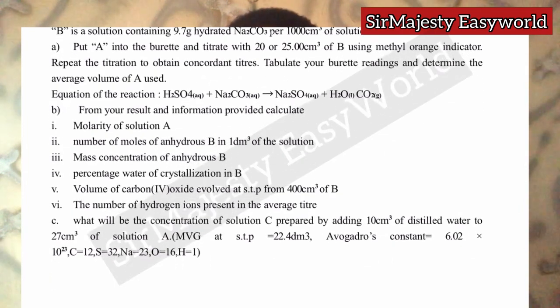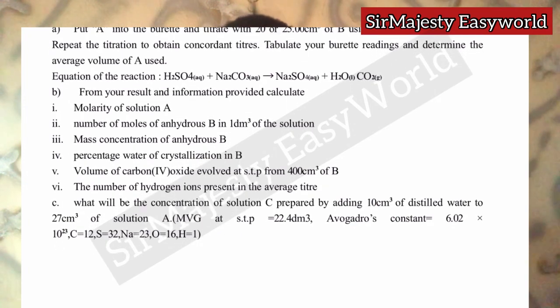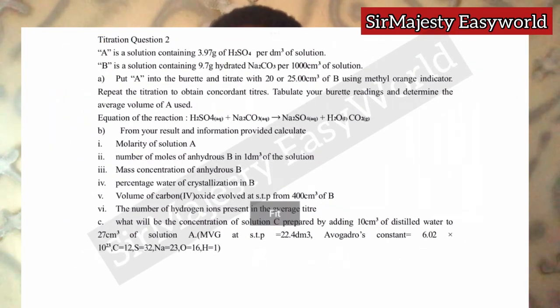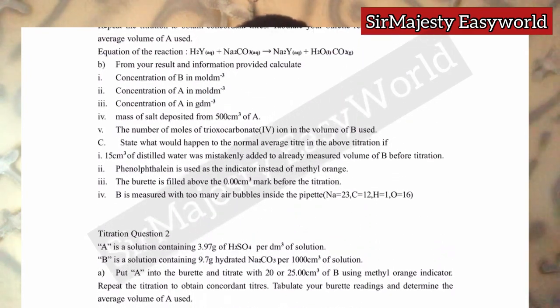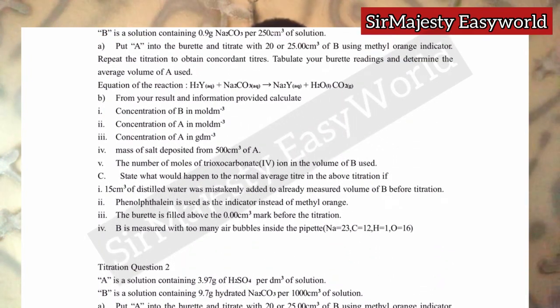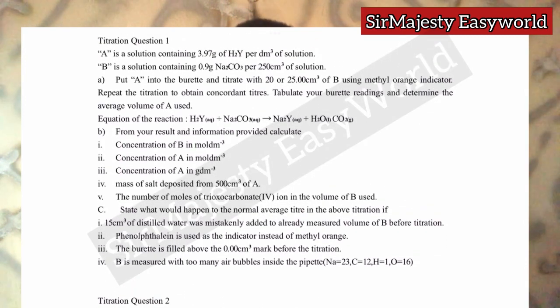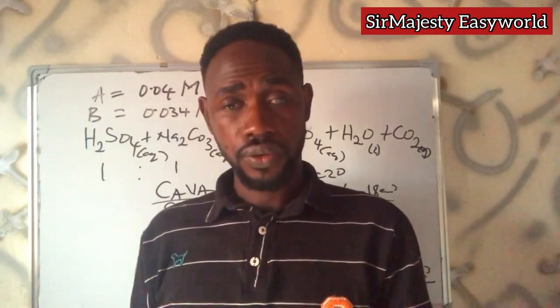I have done a video here on the basic guide, the basic information, and the basic steps and approaches a beginner teacher of chemistry, and a beginner student learning titration, should follow. But that video did not contain the calculation steps. So I will use these 2 questions to teach it in a separate video, calculations involving titrations, or titration calculations, of course.